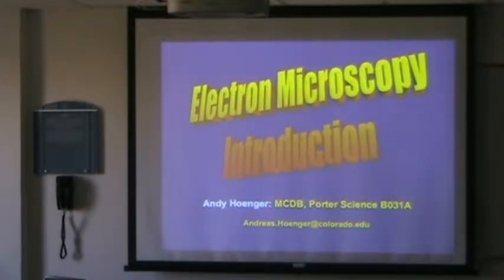Today, he will give us an overview of electron microscopies and how the images are formed in those microscopes.